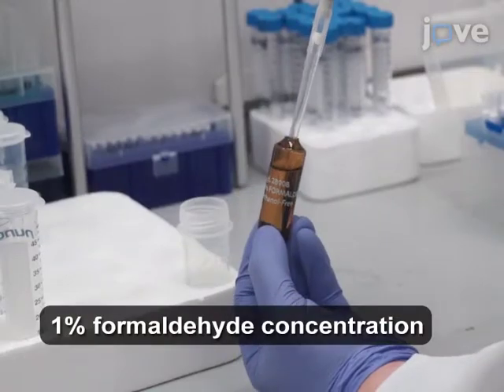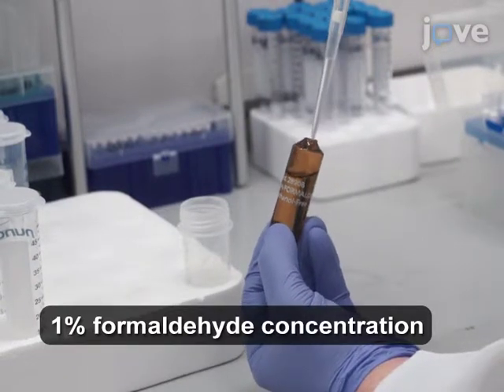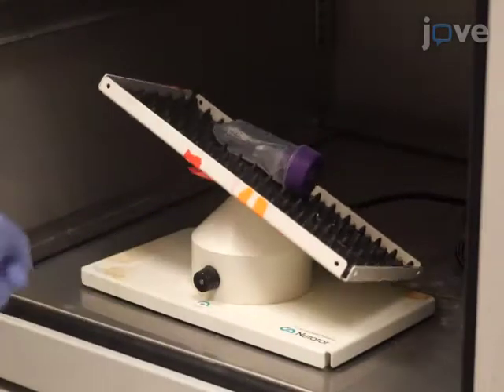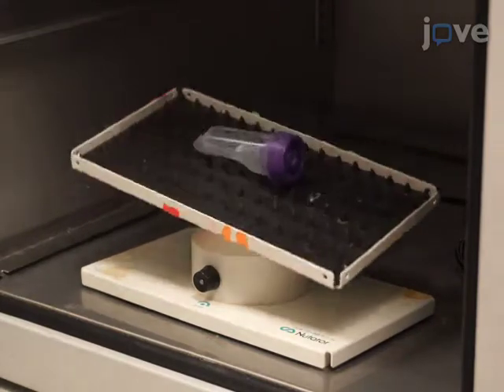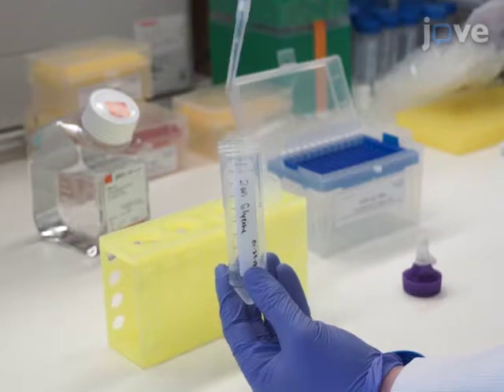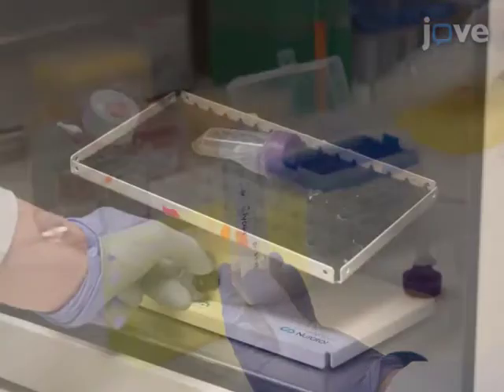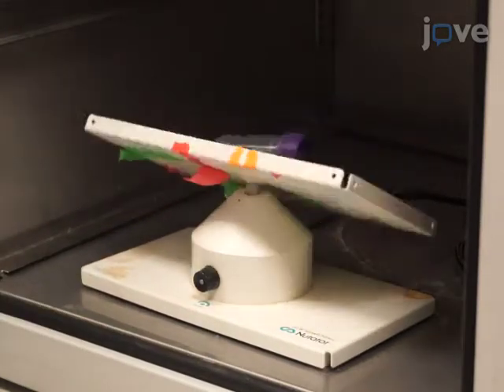Next, cross-link the tissue by adding 200 microliters of 16% formaldehyde per 3 ml of HBSS. Using a mixer, shake the mixture at 10 rpm for exactly 10 minutes at 37 degrees Celsius. After removing the sample from the incubator, add 200 microliters of 2 molar glycine per 3 ml of sample, and shake the mixture at 10 rpm for 5 minutes at 37 degrees Celsius.